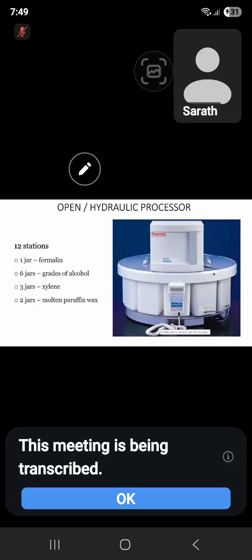Then this is the automated tissue processor. There are 12 stations. Sorry, I have given the name. Forget about the trade name. I am not biased. I got the picture, I cannot cut that one. So 12 stations are there, 1, 2, 3, 4, like that, and on the backside, finally 12 stations. This is the remote controller. By that one, you can program and control.